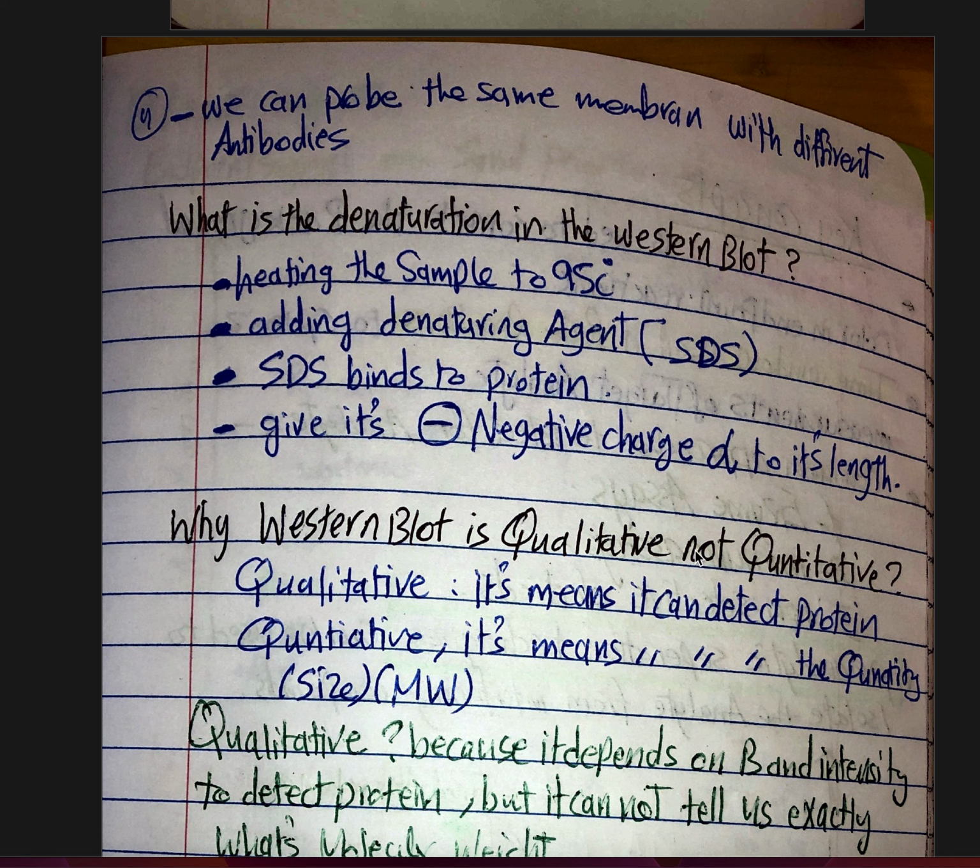The larger the protein, the more negative charge, and we explain that in detail. First we heat the sample to 95 degrees, and then we add the SDS, which causes unfolding of the protein and also gives it a negative charge.